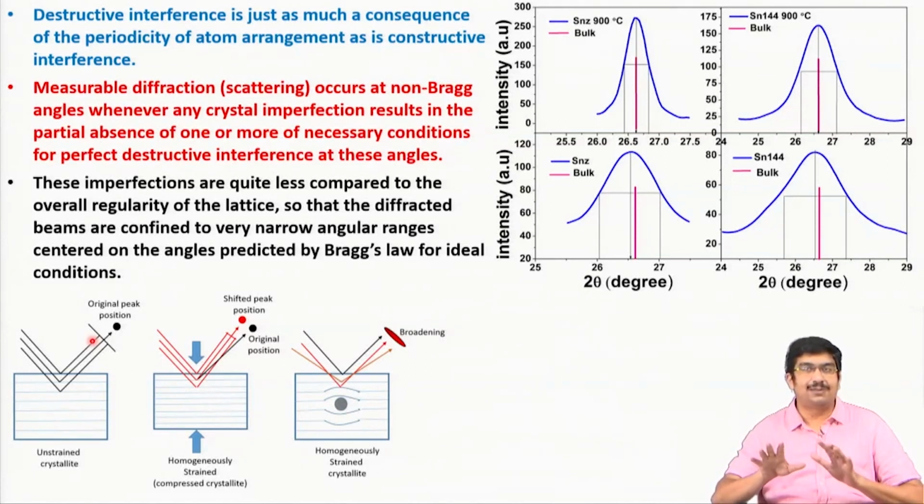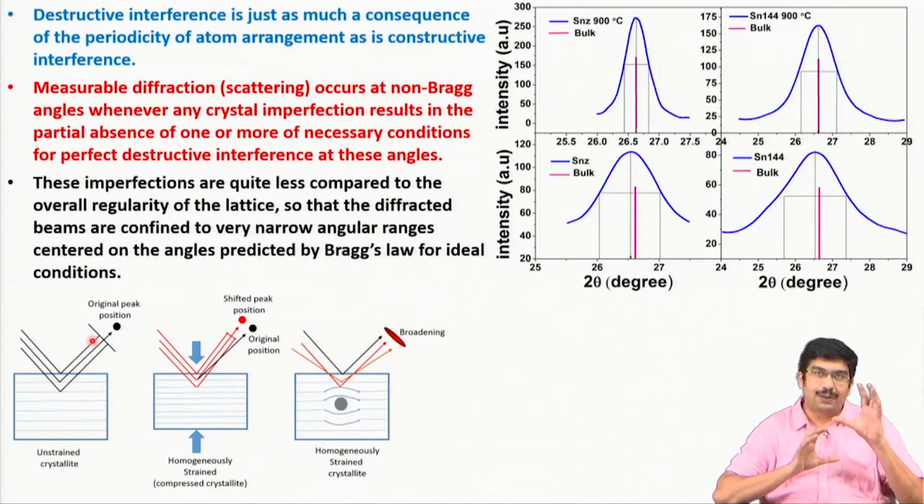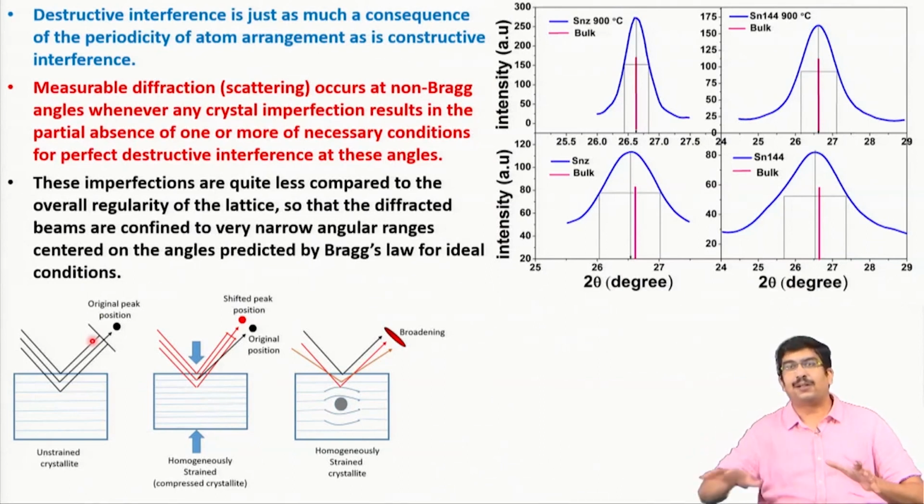So these are the two extremes, and in between there is partial interference. That means when we have defects inside the material, we are going from the perfect constructive interference case to a more imperfect one, closing towards destructive interference.